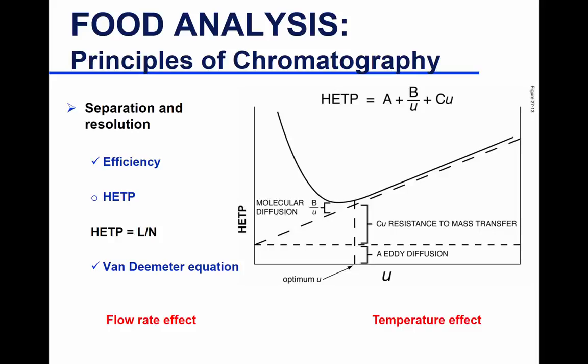I'll demonstrate that. Basically, your stationary phase is made up of particles, right? Packed, and each particle has pores in it. They're porous material. The smaller the pores are, the better the transfer. You have faster equilibrium. If you have large pores, your solute is going to go into the particle and get detained and take a longer time to come in and out and equilibrate. So to avoid this effect and have better resolution, you want to use particles with small pore sizes. You don't want a lot of large pores.